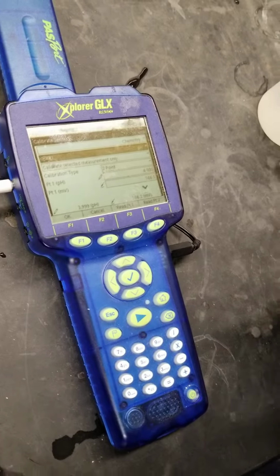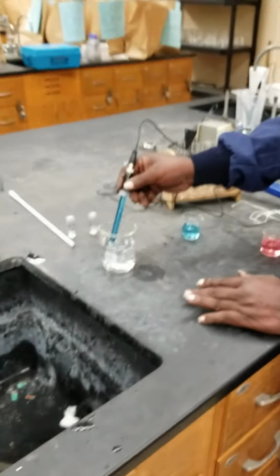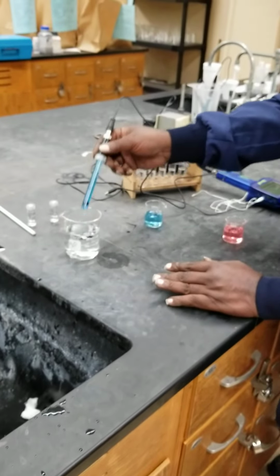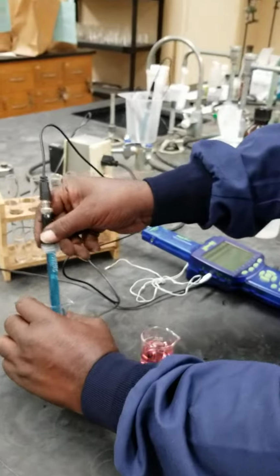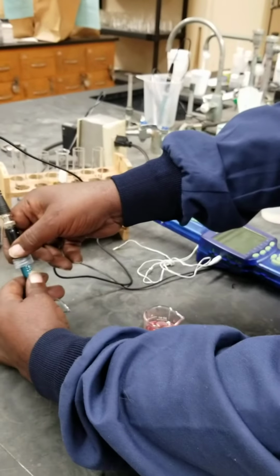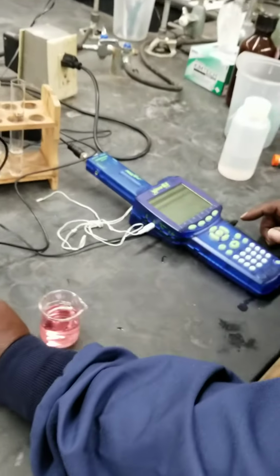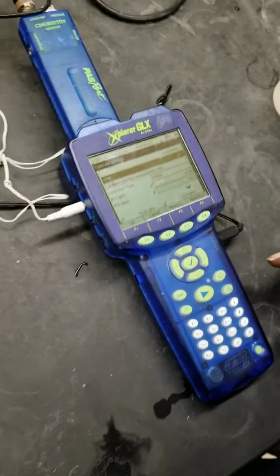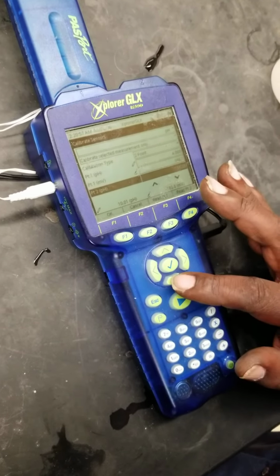And then at that point, I will quickly rinse my electrode, put it in the other buffer solution. This is now pH 10. And then I'll go here, and these directions will be in your manual. Scroll down to the second point.